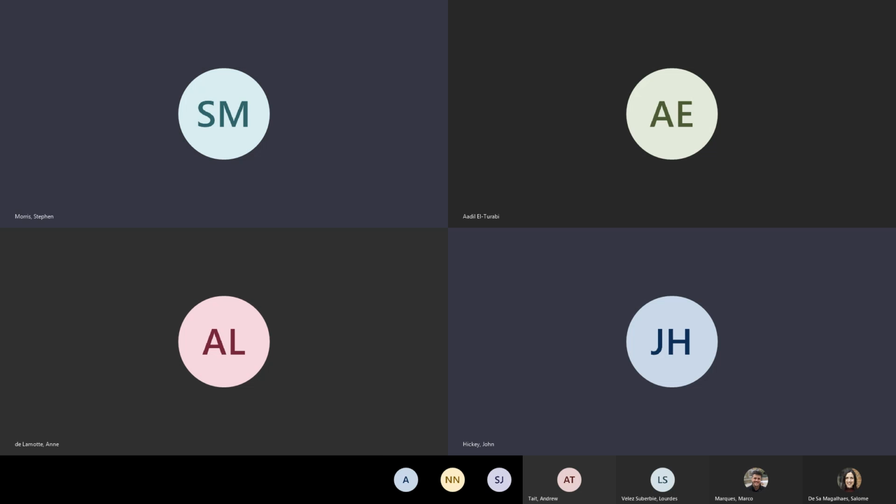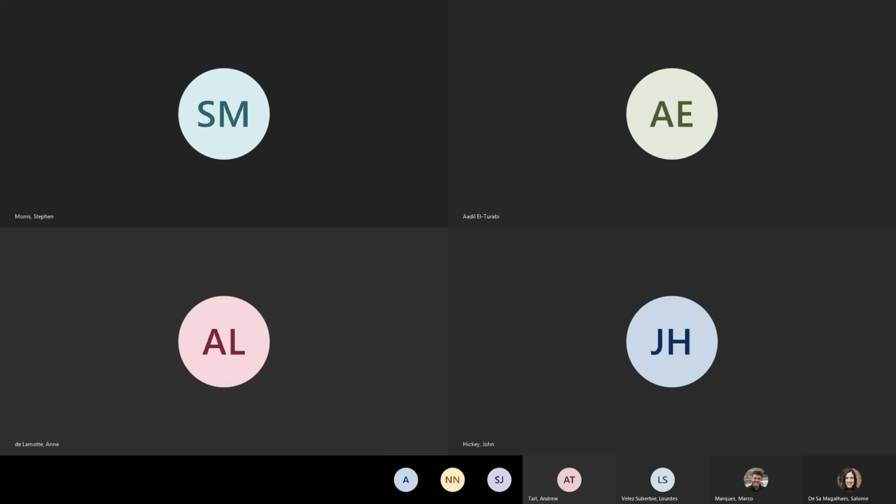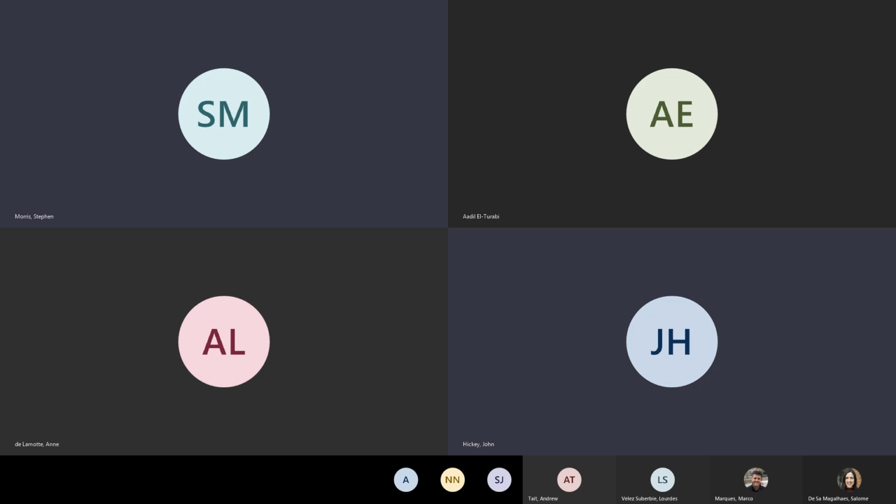Okay. He's asking about post-processing steps for mRNA. That would be a challenge. Trying to think of how that would be done. Yeah, I think that would be very hard to establish, especially in a continuous workflow. That'd be very challenging.